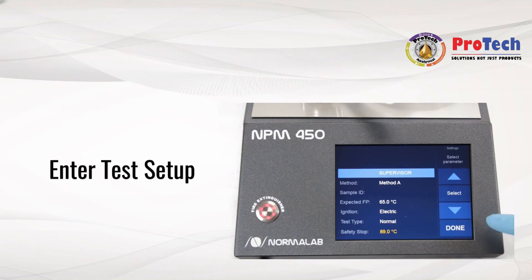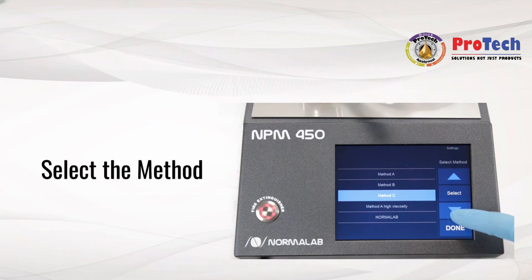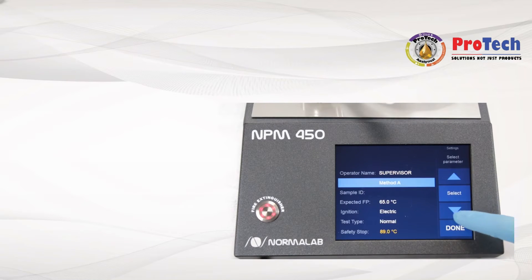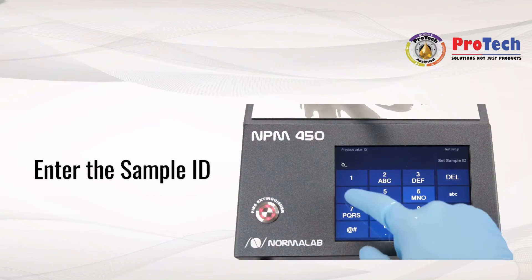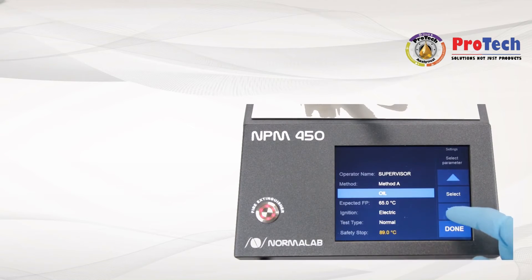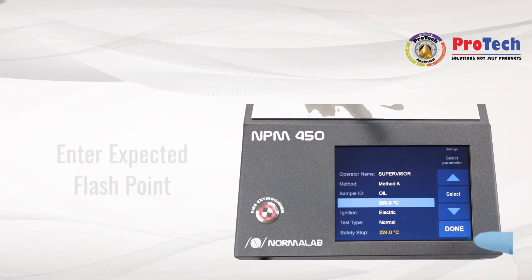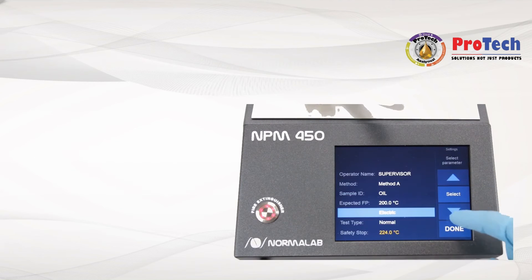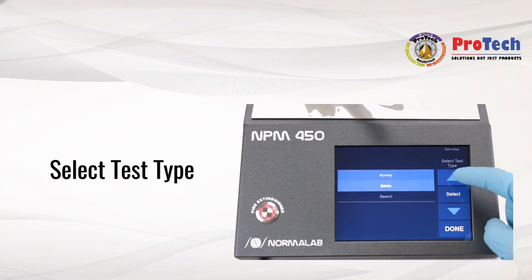Enter the test setup and select your method from the list. Enter your sample ID and the sample's expected flashpoint. Select the ignition type for the test between gas and electric. Then select the test process: normal, safety, or search mode.